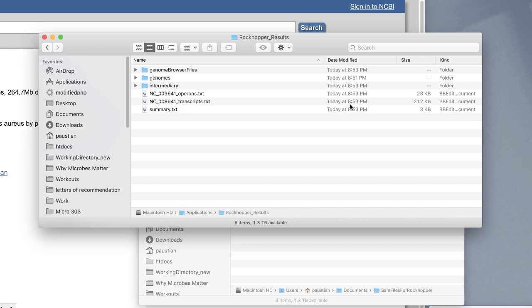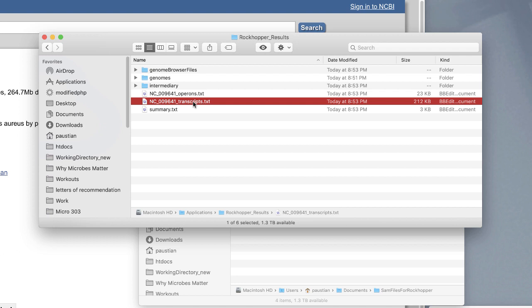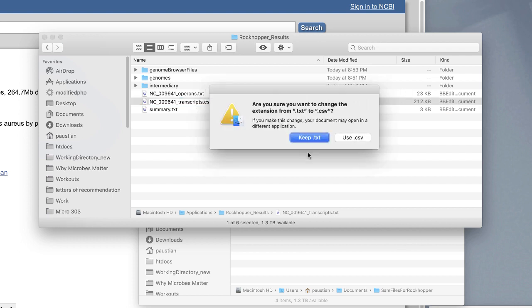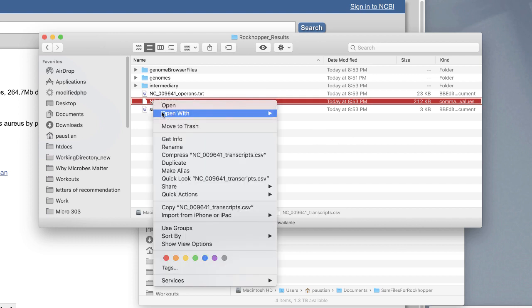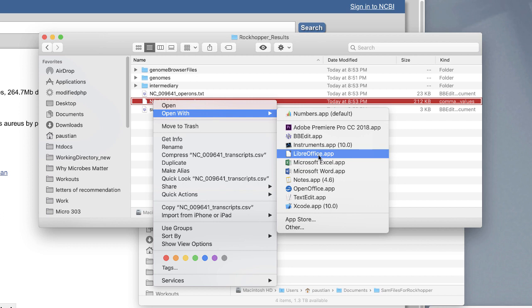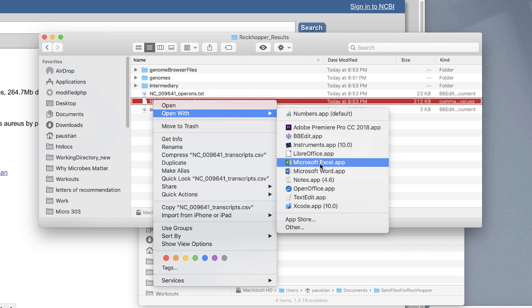They'll be labeled with a label that identifies when it's done — look at the time it was done, doing this at 8:53 PM. You want to open the transcripts file. But before you do that, let's change the extension. We're going to change it to comma-separated values. It's going to say are you really sure you want to do that — yes.